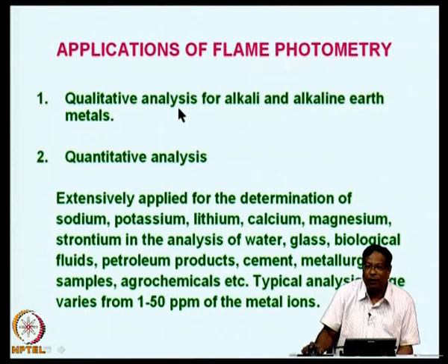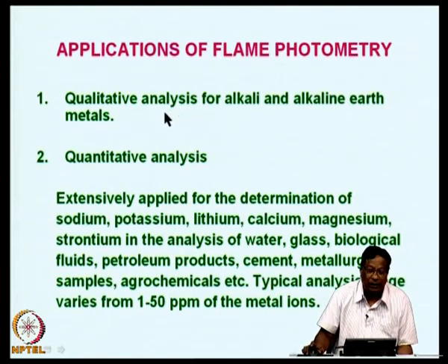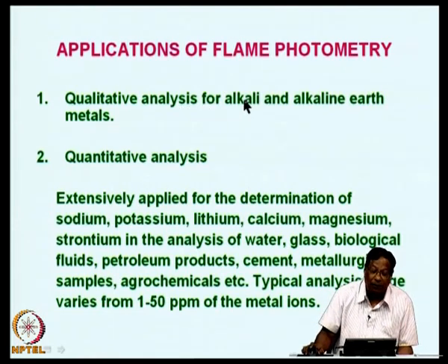If it gives you a yellow flame, yes, it contains. If it does not give you a yellow flame, you can say no, it does not contain sodium. This is a pass fail test. Similarly, for potassium, a red flame, yes; non red flame, no.